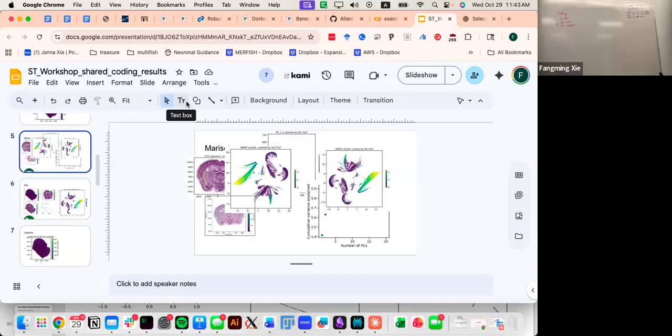Yeah, it seems to be okay. So it looks like this line, I was wrong, this line should be able to run too. Let's see. Yeah, it did. So first is to locate, it must be this line, UMAP fit_transform. So we know UMAP is correct. It has a function called fit_transform.